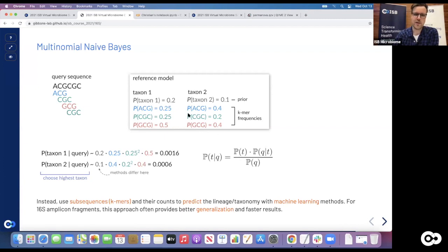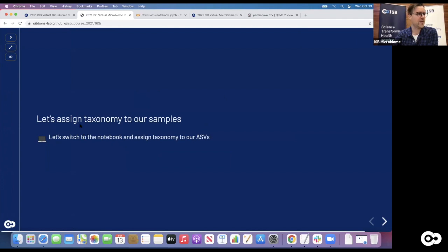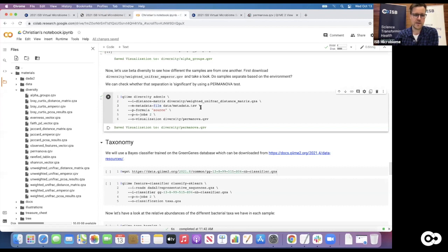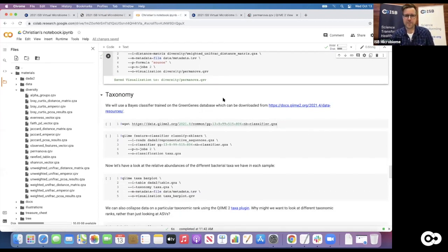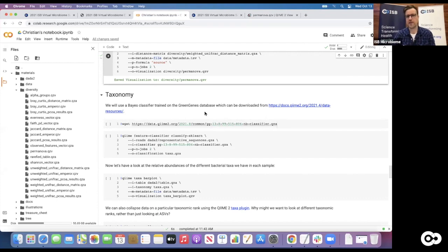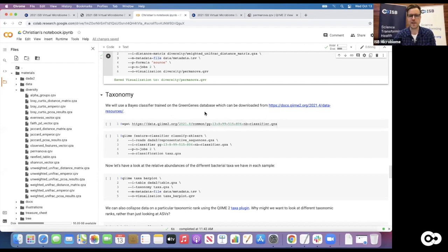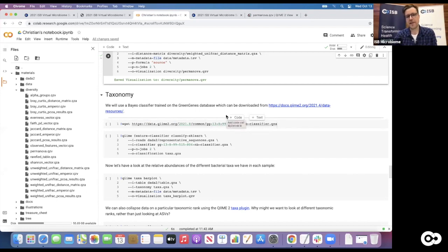So let's assign the taxonomy to our samples. The first thing we need is a classifier - a database - and it can be downloaded from GreenGenes. There are a lot of different databases to consider. One important question is: was the database generated from the same variable region that you generated your data from? In our case we use a database that uses exactly the same primers, so we're good. The second question is how extensive and well-maintained is the reference database. GreenGenes is a bit outdated - the SILVA database is definitely much larger and better maintained. There's also the NCBI reference database which uses 16S sequences from RefSeq and full genomes on NCBI.